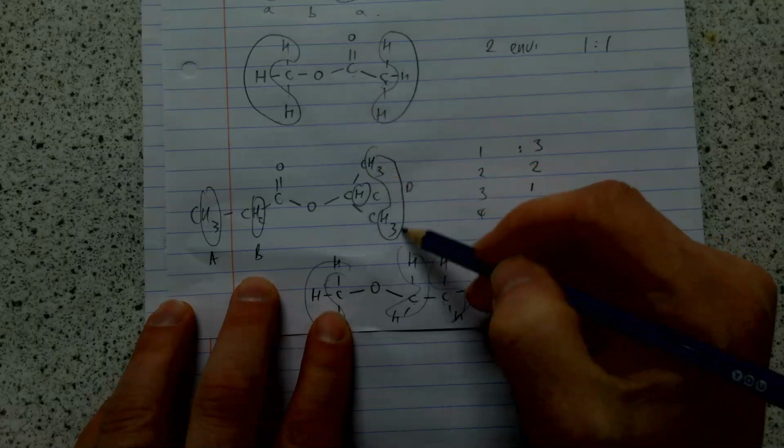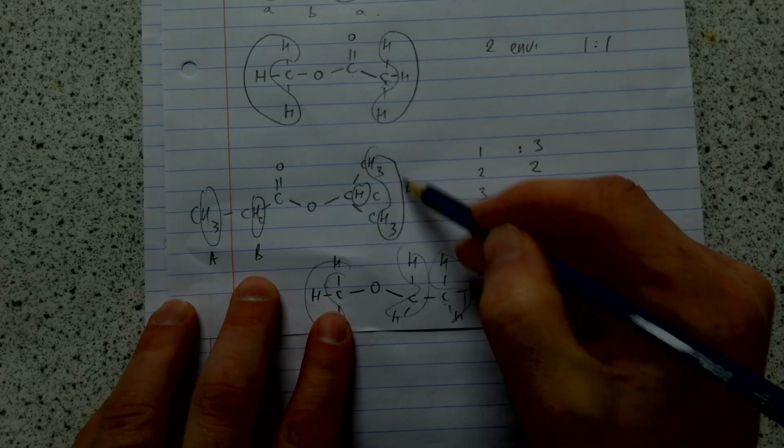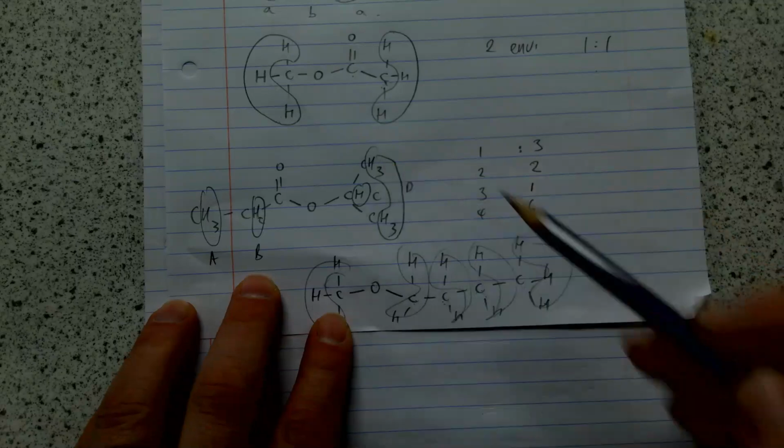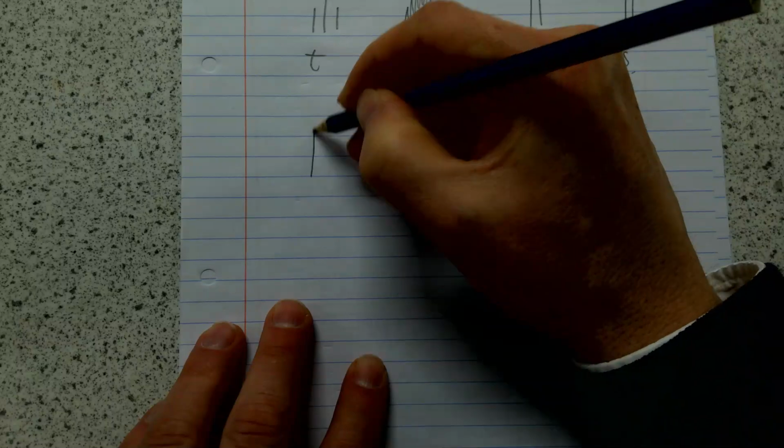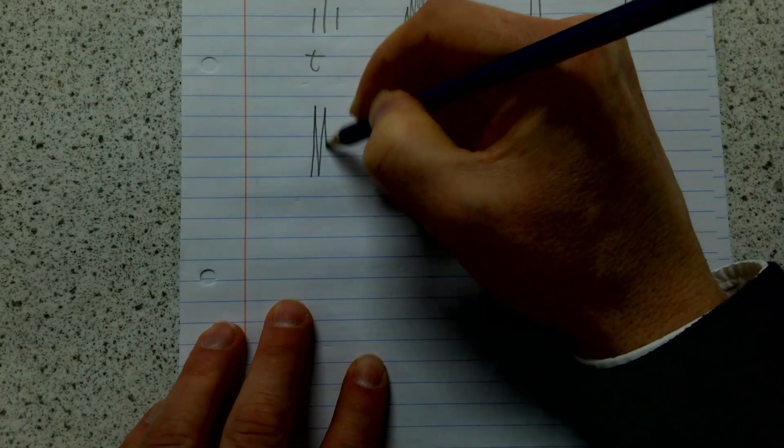And these 6 hydrogens here, how many hydrogens on the adjacent carbon for those 6? Close, a doublet we call it. But you're right, n+1 is 2, so it's a doublet, and doublets look like that. It's like two things next to each other, kind of sticking two fingers up at you.